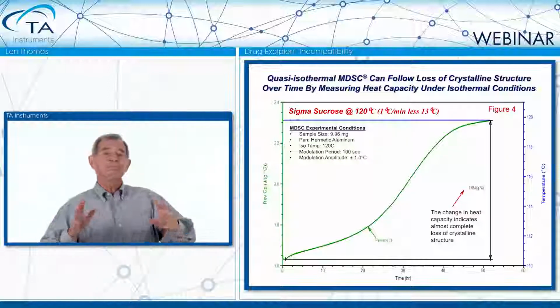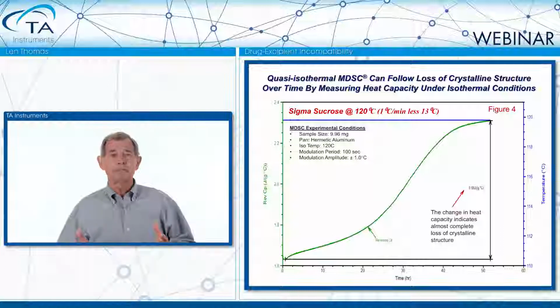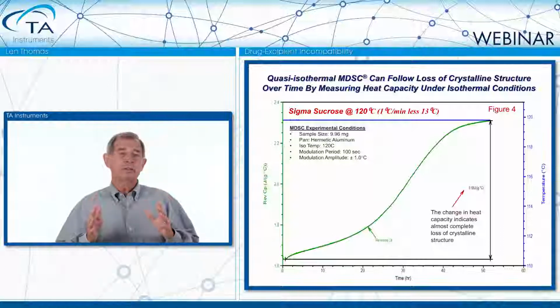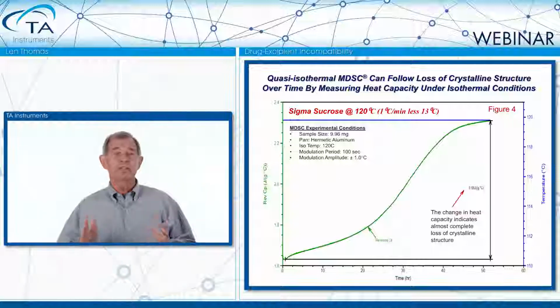Okay, so we said that once we know there's apparent melting occurring, we might want to do further kinetic analysis, we might want to do chemical analysis. And so the first thing we do before we go to those isothermal modulated DSC experiments is determine the best temperature to do those analyses as a function of time in order to get kinetics versus temperature as well.